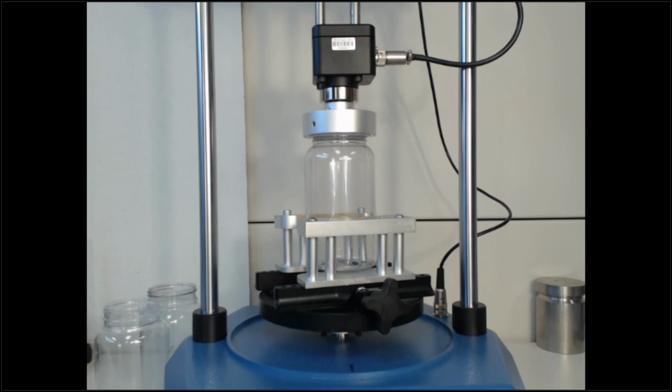Most importantly, the components that go into a test. Now, these will also be true with the new Vortex Pro and the Helixa Pro. It's going to have its sensor, it's going to have that base fixture that grips the bottle, it's going to have a machined chuck or a layered chuck or a split mandrel that grips the cap. And all of these components will pretty much be very similar or the same in the new software configuration. So let's run another one.